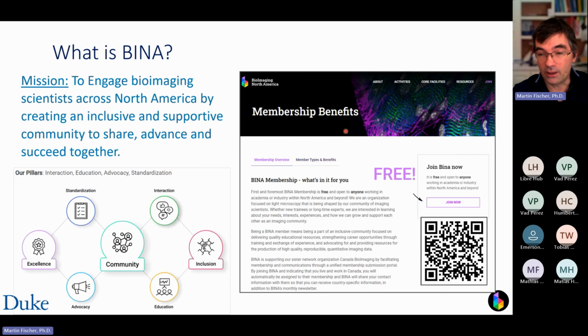So BINA is a community. It's a foundation, a nonprofit organization, and we focus on things like advocacy for microscope careers. We develop workshops, tutorials, things like that. We try to help with standardization, but of course we have no regulatory power. Therefore, our opinion carries the most weight the more members we have.